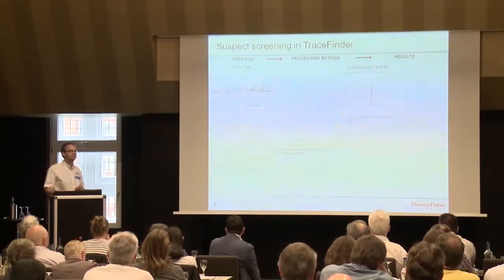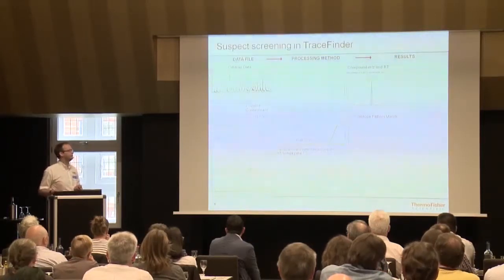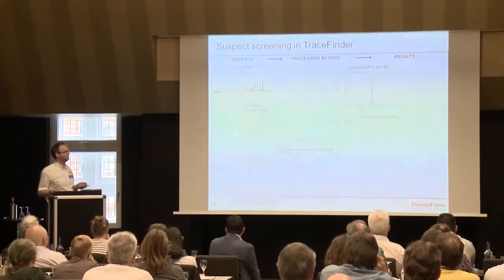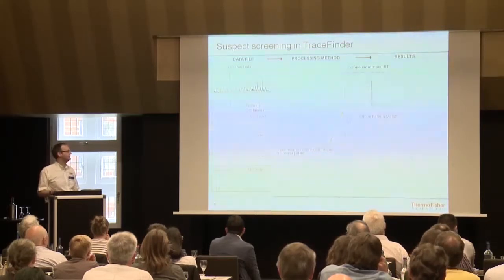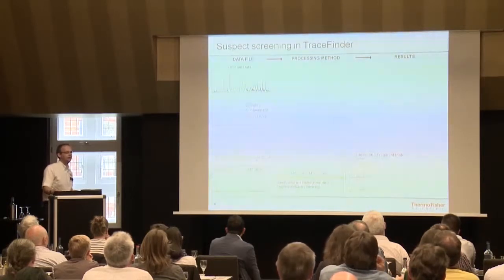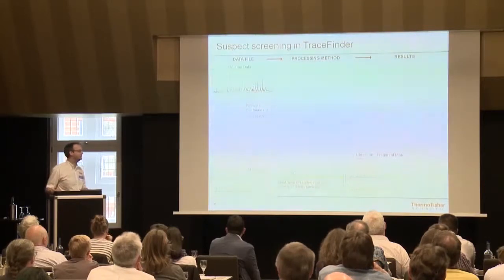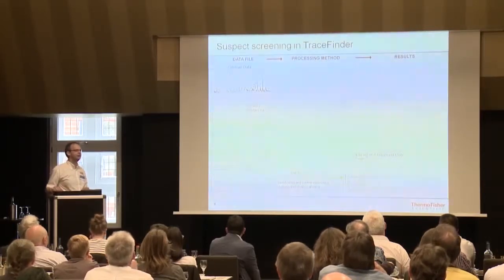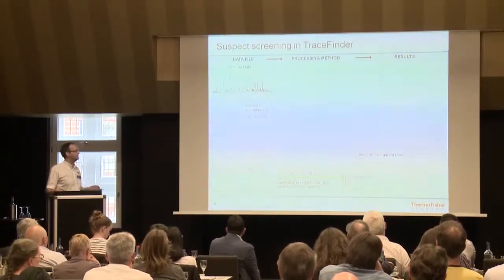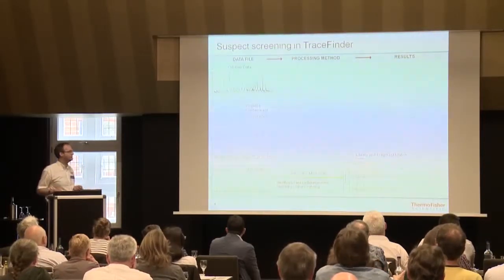And this comes for free in full-scan analysis because the isotopic pattern is always present. So that's the first thing we can do. We can run the isotopic pattern match, which is the first point of confirmation in this point. And then I said, the method run here will be, as a starting point, a full-scan AIF method. So we run the all-ion fragmentation, so we have a basically rather crude but existent fragment spectrum.